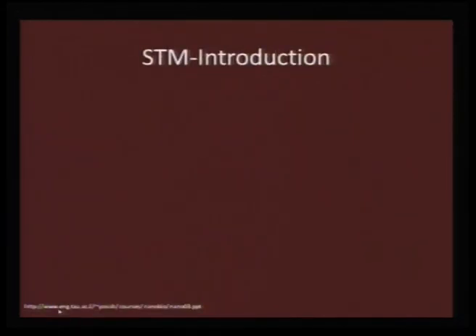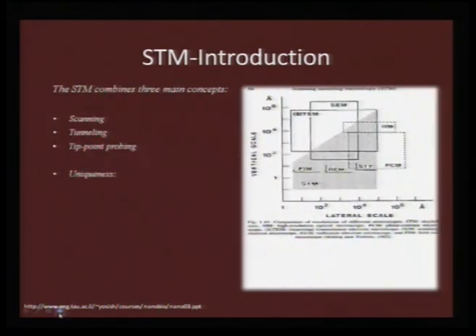So three principles that we can come out with: one is scanning, one is tunneling, and the other one is tip point probing. Actually the protocol in a scanning tunneling microscope is in the reverse order. First you try to bring the tip in closer proximity to the surface, and then you establish a tunneling, and once the tunneling is established, then you do the scanning. So these are the three important concepts that you work out during the STM.